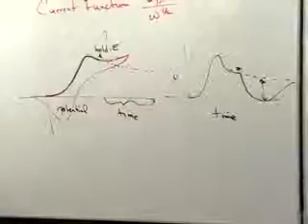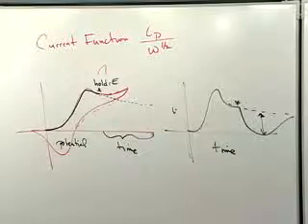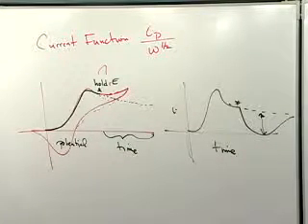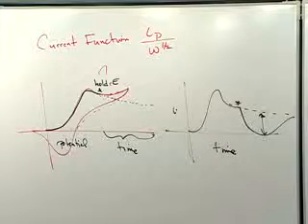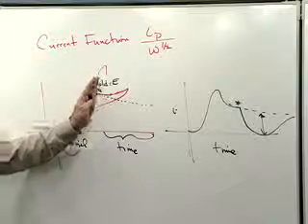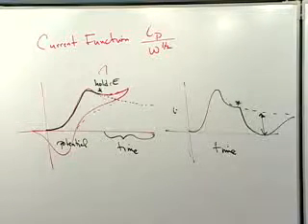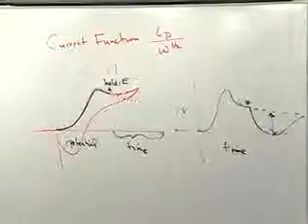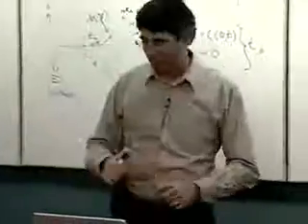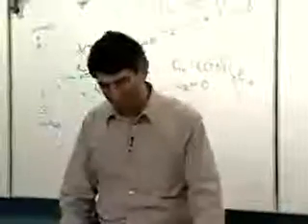Or in the case of an XY recorder, they often have time bases on them also, so you could run one that was a regular current voltage, and then right on top of that, a current time plot. Give you the same result, just holding your potential right there. Scan at the normal speed, hold your potential right there. So that's a very good way to do that. That becomes a little bit tricky with a computer and memory and all that. But you could dust off that old XY recorder you have in the corner of the lab if you need it, and do it this way.